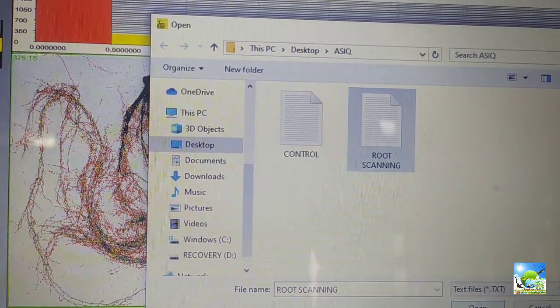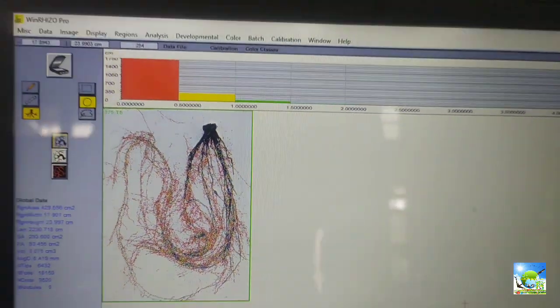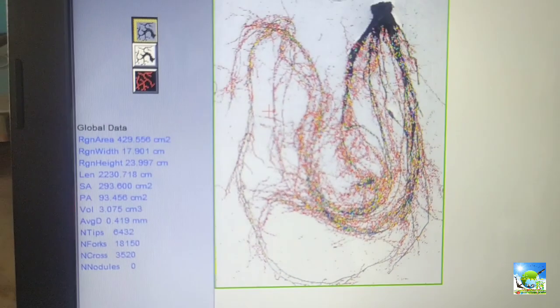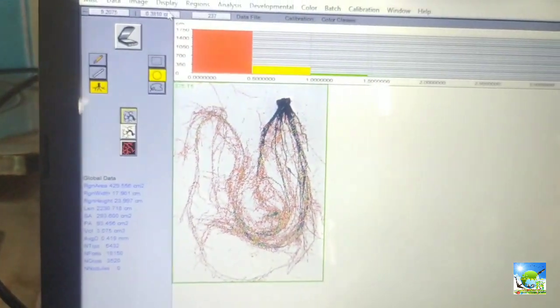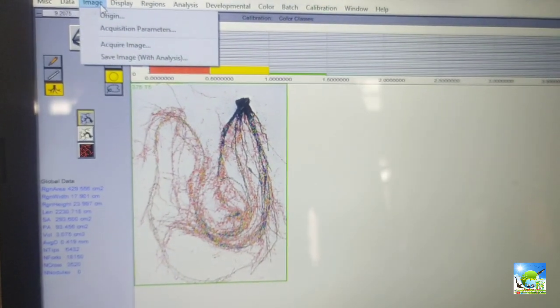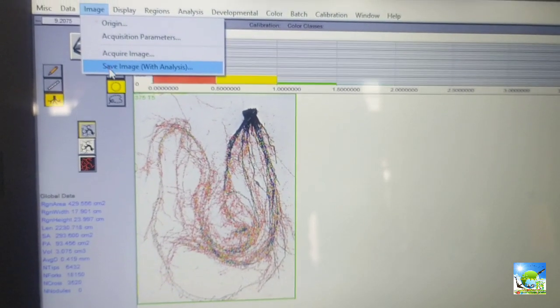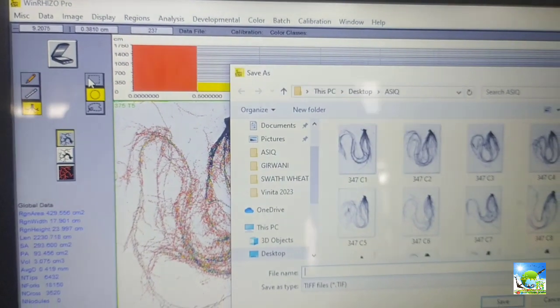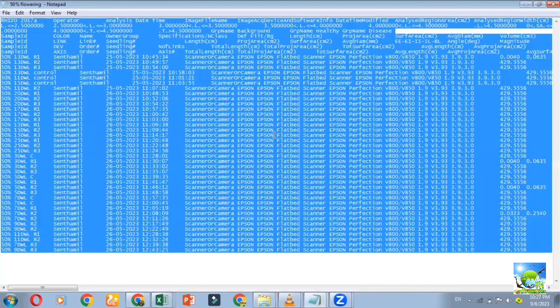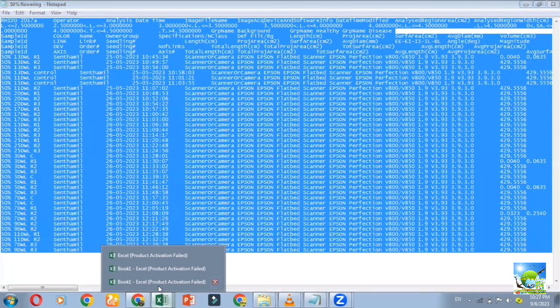During the next scanning, data will be saved in the file chosen during the first scan. If you need to save in a new file, close the software, open it again, click 'Create One,' and save it. For saving the image, click on image in the toolbar, select 'Save Image with Analysis,' give a name to the image, and save it in the respective folder.